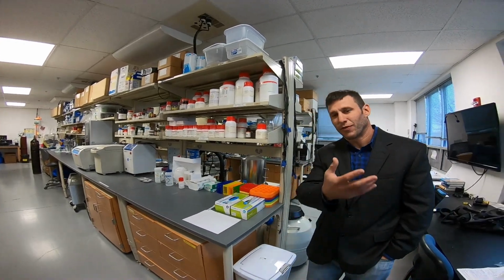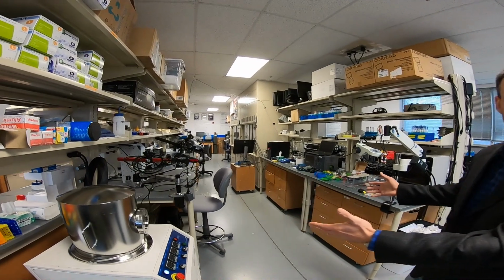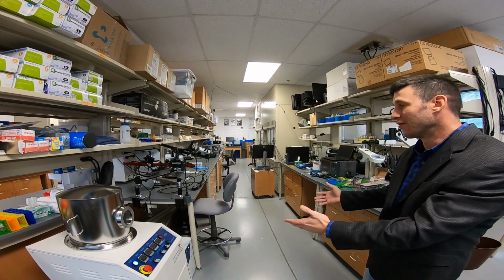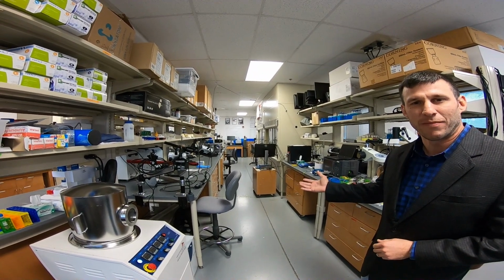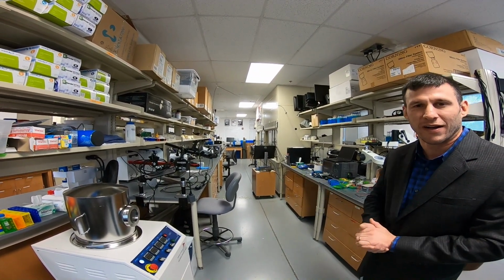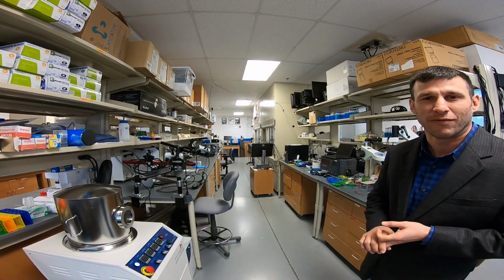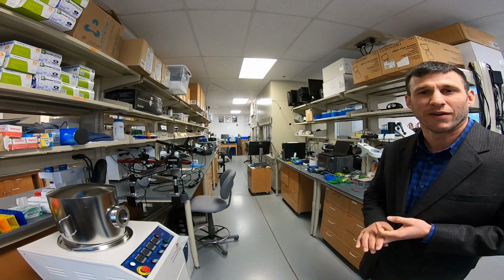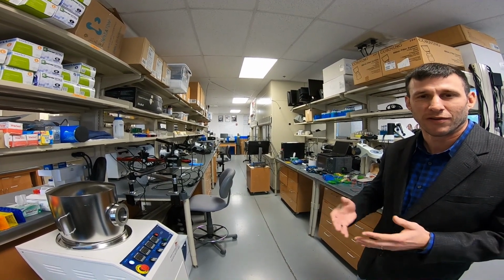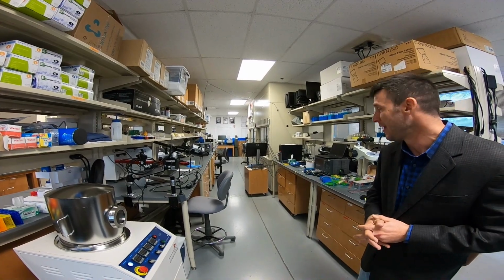And if you come further down to this section of lab, you can see this section is dedicated more to manufacturing applications. We have several robots in the lab that we utilize for additive biomanufacturing applications and sensor additive manufacturing applications, and those robots are also leveraged for high throughput characterization applications and automated characterization and quality control in the space.